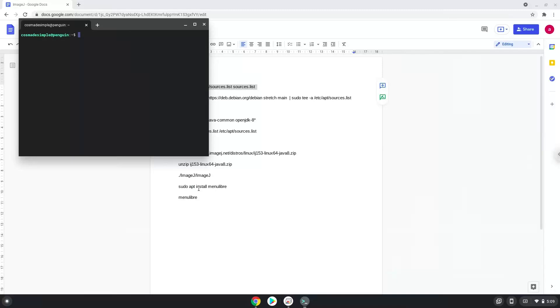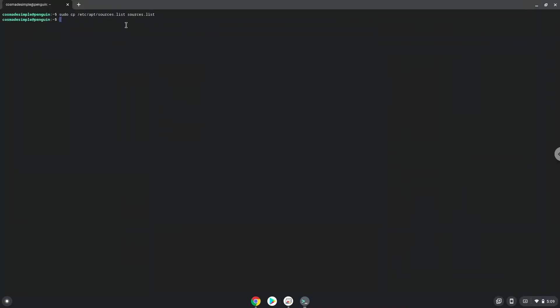We do this because during this tutorial we will modify the source file, and in the end we will revert it to how it was with this copy. Now we will add one line of code to our source file, which will allow us to install Java 8, which image requires.